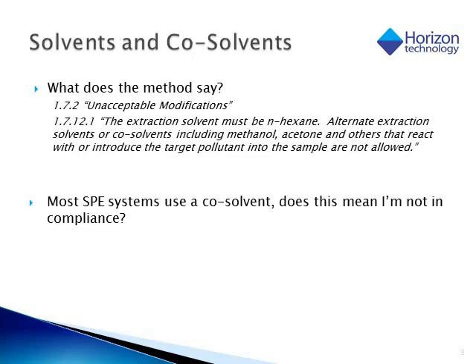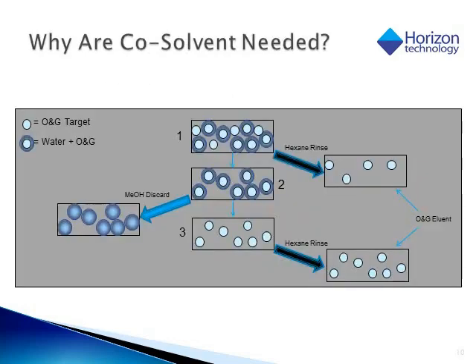So I'm allowed to run solid phase extraction. That's great, but the SPE vendor lists methanol as one of the solvents. Can I do that? Well, the reason that most SPE manufacturers use a water-soluble solvent in the extraction process is to remove residual water from within the disc or cartridge.